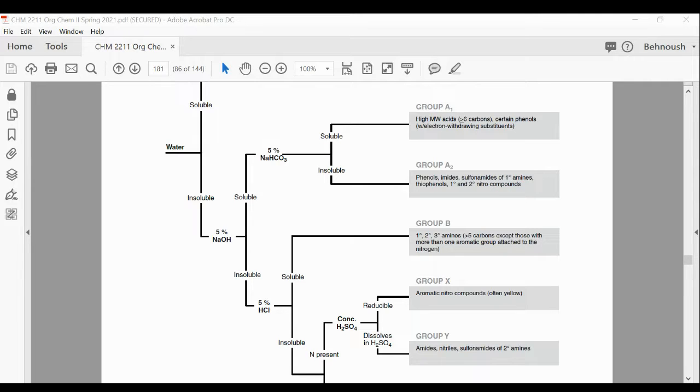Water. Okay, water would discriminate. Which one would dissolve in water? The one with the least amount of carbon? Least. Okay, it has to be less than 5. So the propanone would dissolve in the water, but octanone doesn't dissolve. So if you test solubility with water, and if it dissolves, you know it is propanone. If it doesn't dissolve, you know it is octanone.